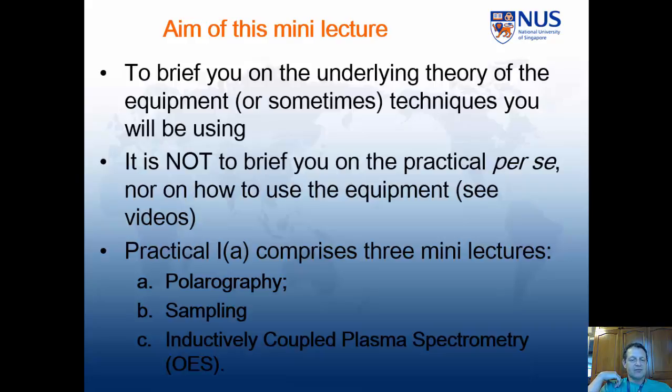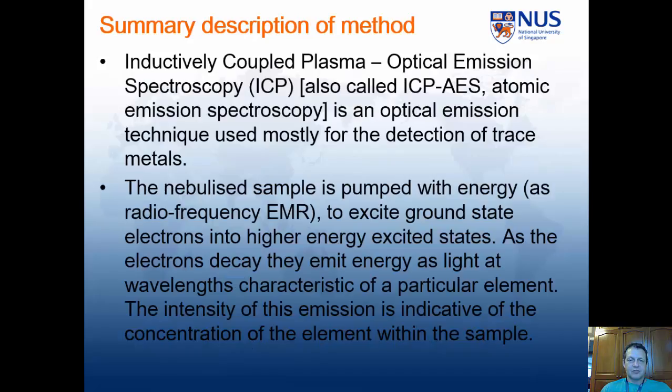There's polarography, there's sampling, and there's this one, which is inductively coupled plasma spectrometry, or ICP-OES. Okay. So, this is a summary description of the method, which we'll come back to again at the end. It will probably mean more after this lecture.